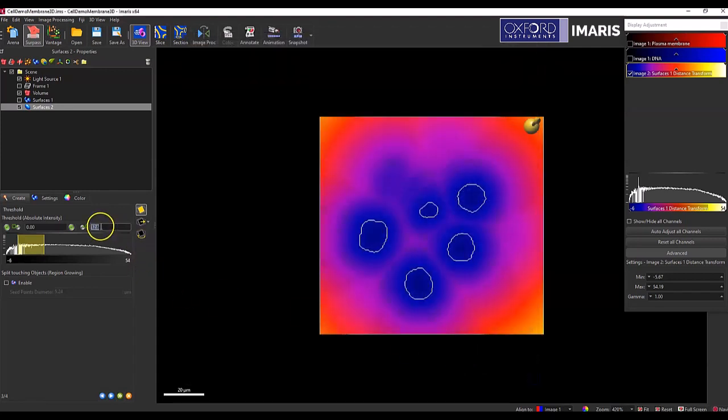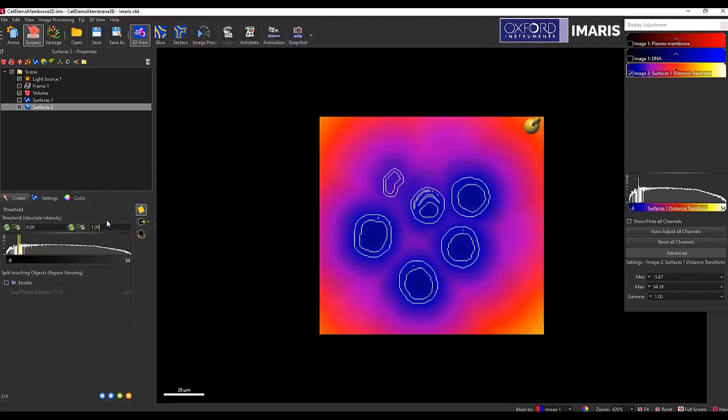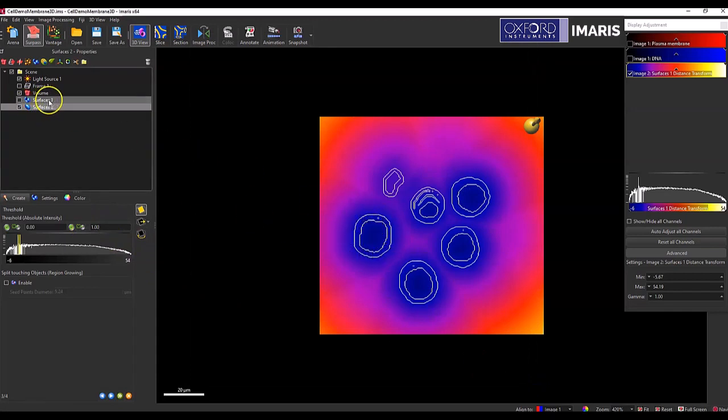So if I set the top of the threshold to about one, that's going to be about a two pixel diameter around what that first surface would be. And so that's a dilation.